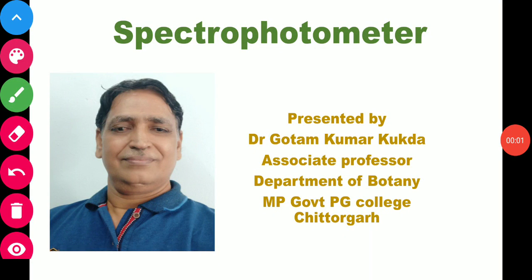Dear students, we will have a lecture on the spectrophotometer, an instrument used in biological laboratories. What is its principle, how does it work, what are its different parts, and how is it useful to the biological laboratory? We'll learn in the coming slides.